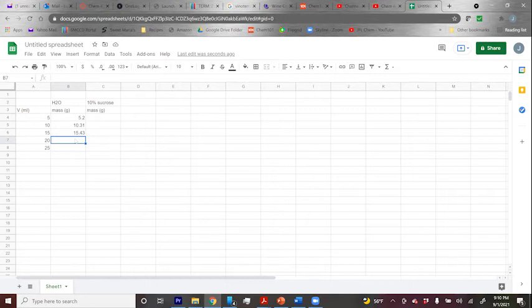The water in the cylinder that we measure to get the sucrose, do we pour it back into the cup? Oh, no, you can just dump it. That's fine. I mean, you can pour it back if you want, but generally it's something we don't want to do. We want to avoid contamination if at all possible.